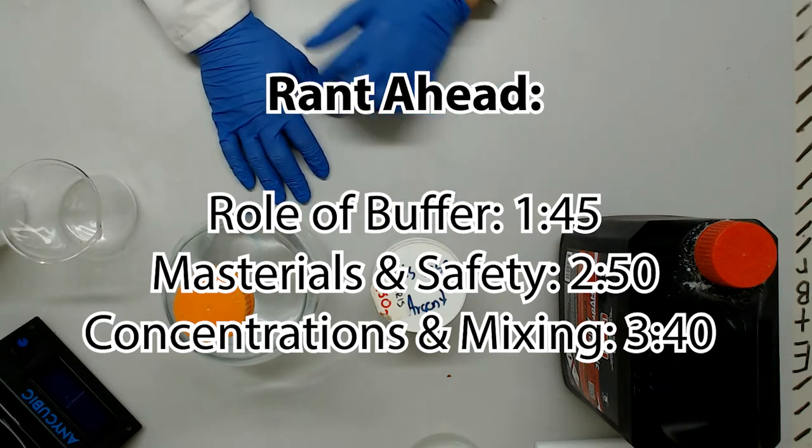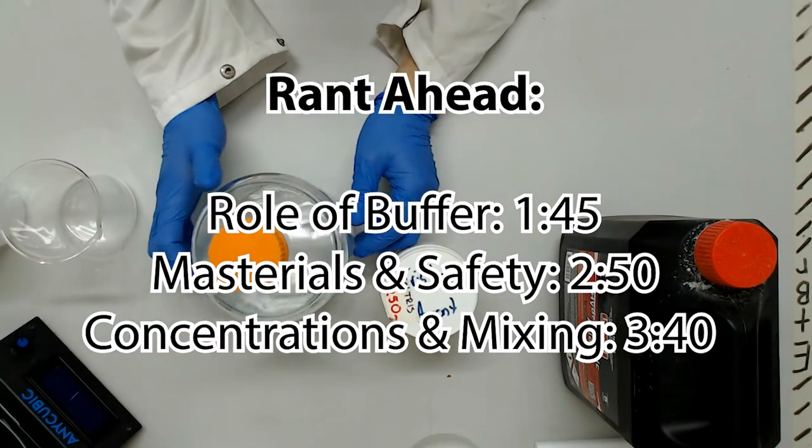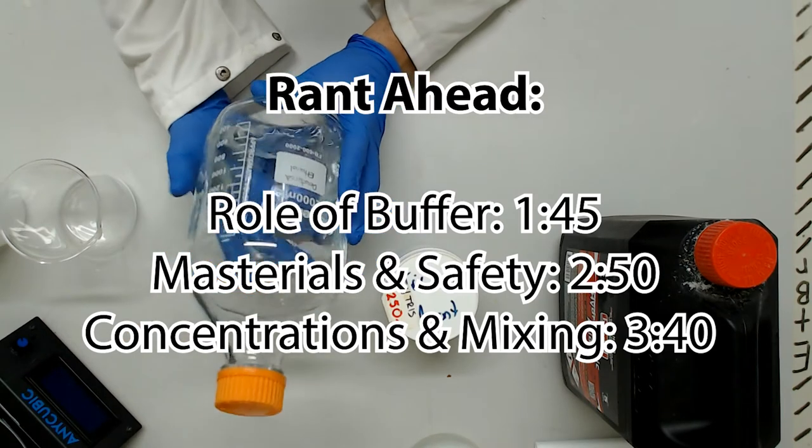Hello and welcome to the fifth and second last video in our mini prep buffer mixing series, Buffer PE aka Buffer 5 or Wash Buffer 2.